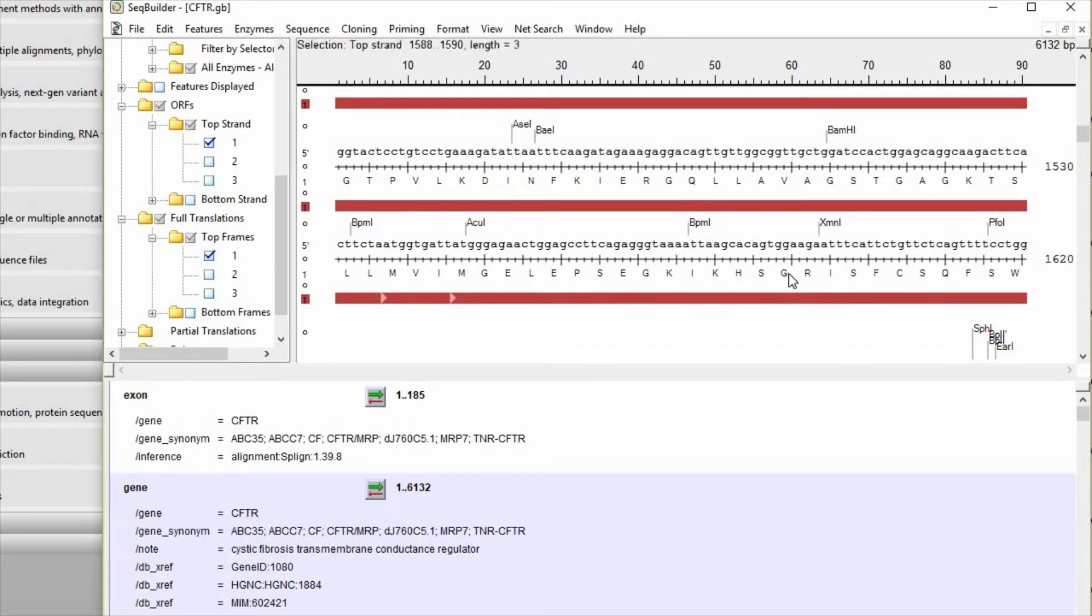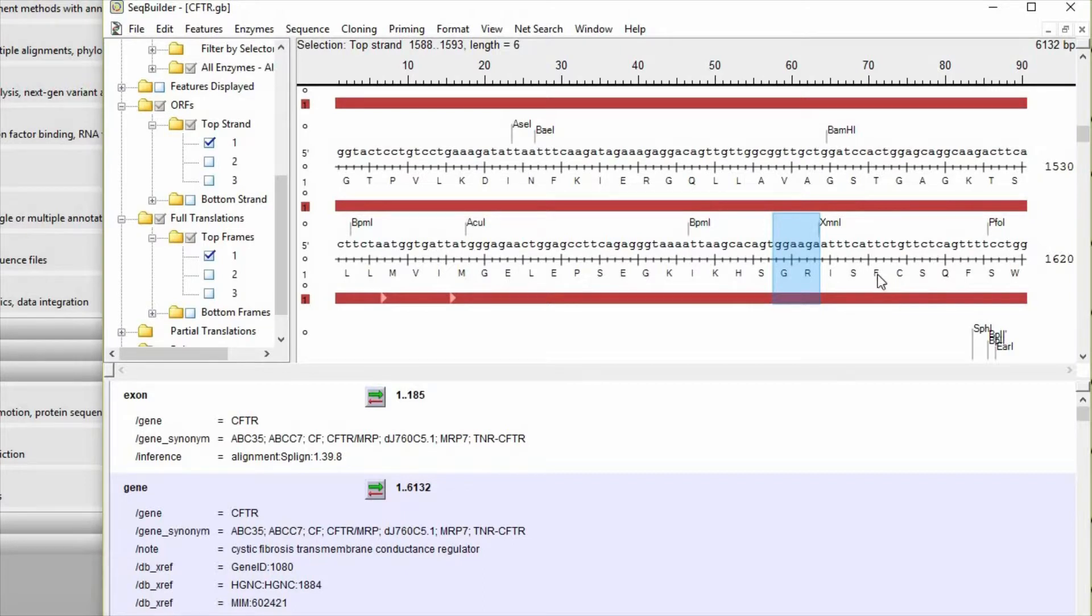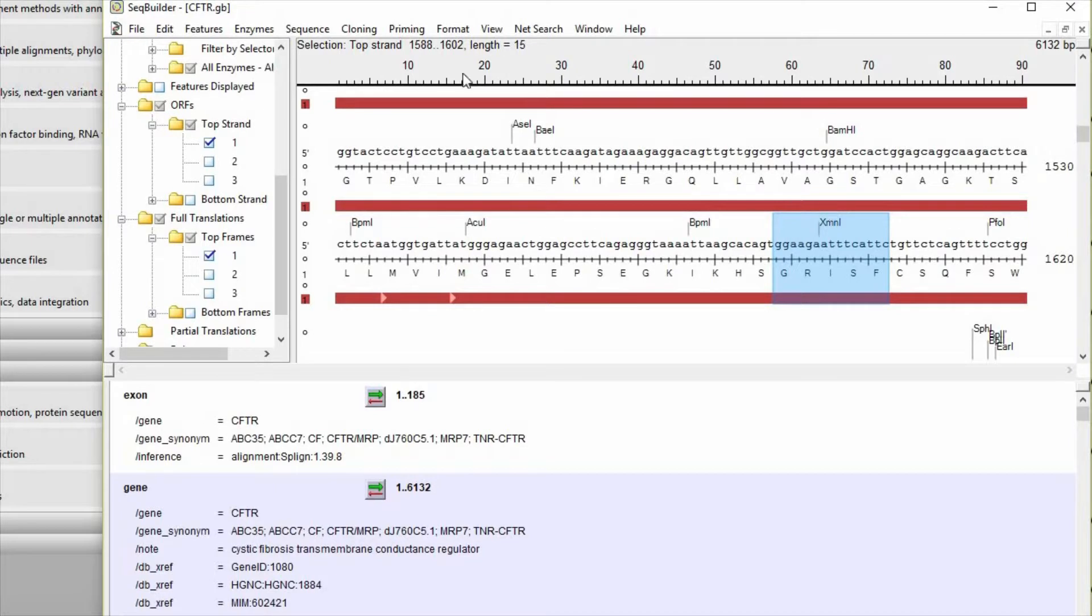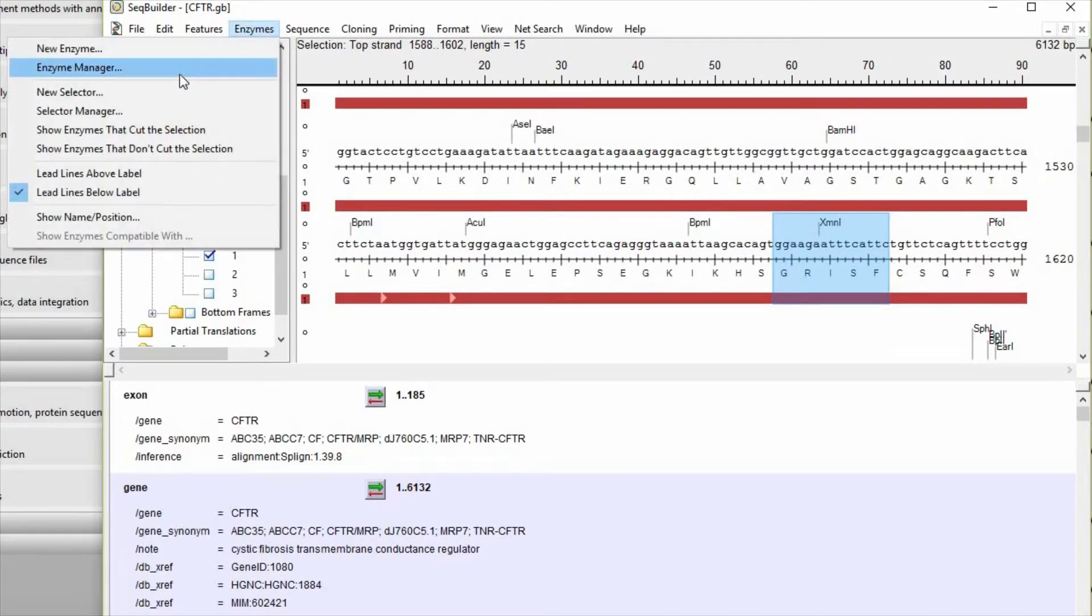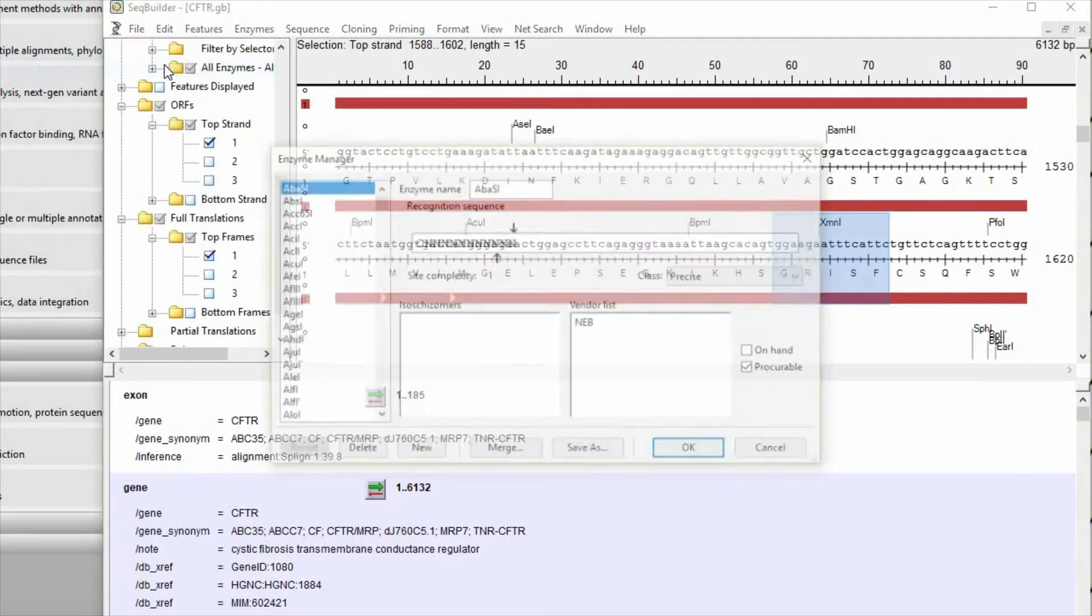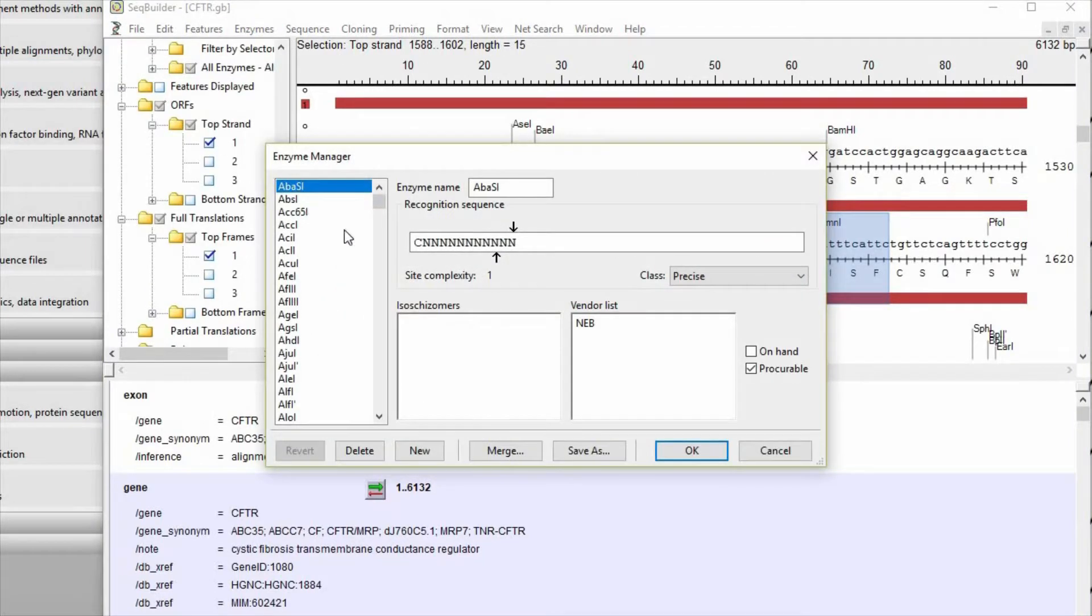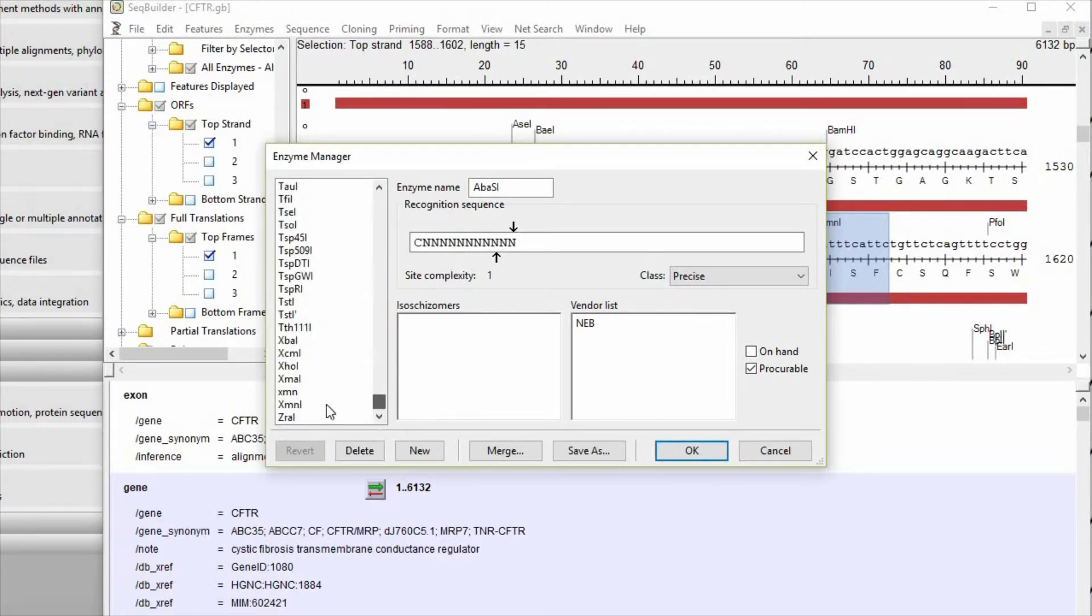So now when we go back to our DNA sequence, we can find this GRIS motif, and we notice that there is a restriction enzyme site, XMN1. Let's make sure we understand what the pattern is for that restriction enzyme.